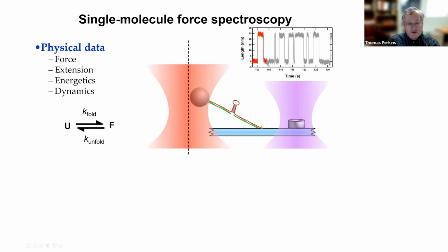Many of you may be familiar with this assay. It was developed by Carlos Bustamante many years ago. Shown here is some data from our lab, as well as a cartoon illustration of an optical trap. When you pull on an RNA hairpin, you can easily measure it unfold and refold with great fidelity due to the precision of optical tweezers.